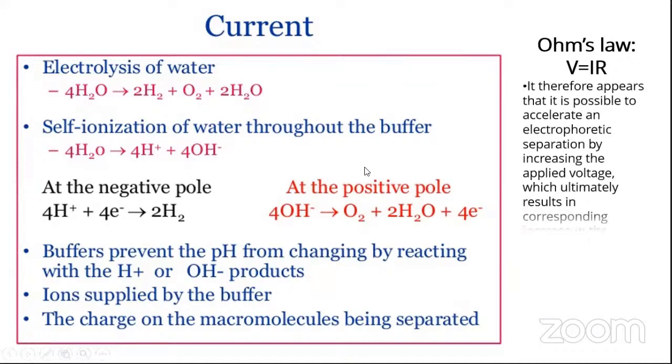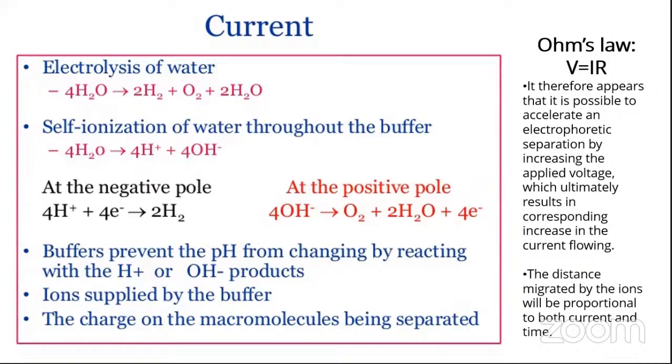Now, what's that problem? Okay, resistance is actually going to retard the movement of molecules and hence is going to affect the current in an adverse way. And because the current is going to get affected, you are not going to get effective separation.